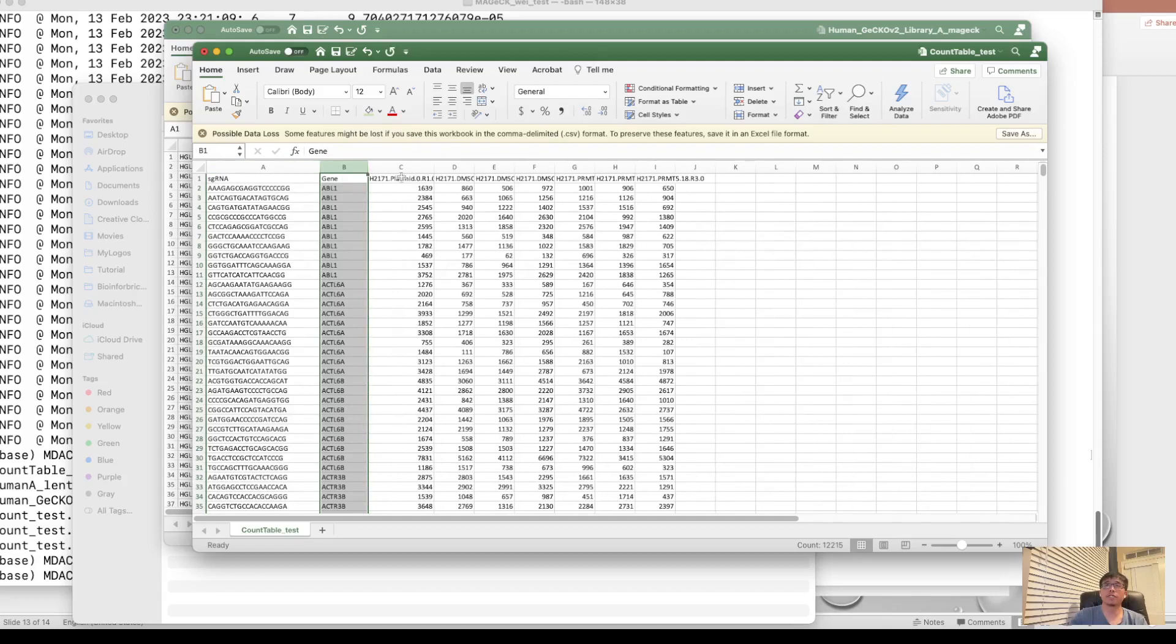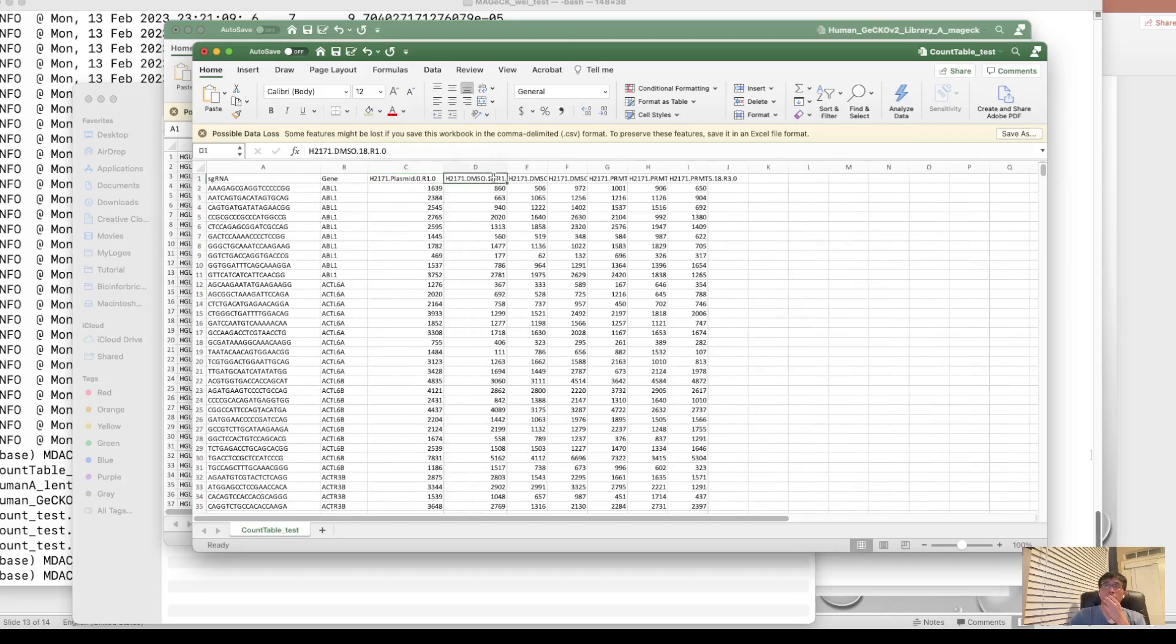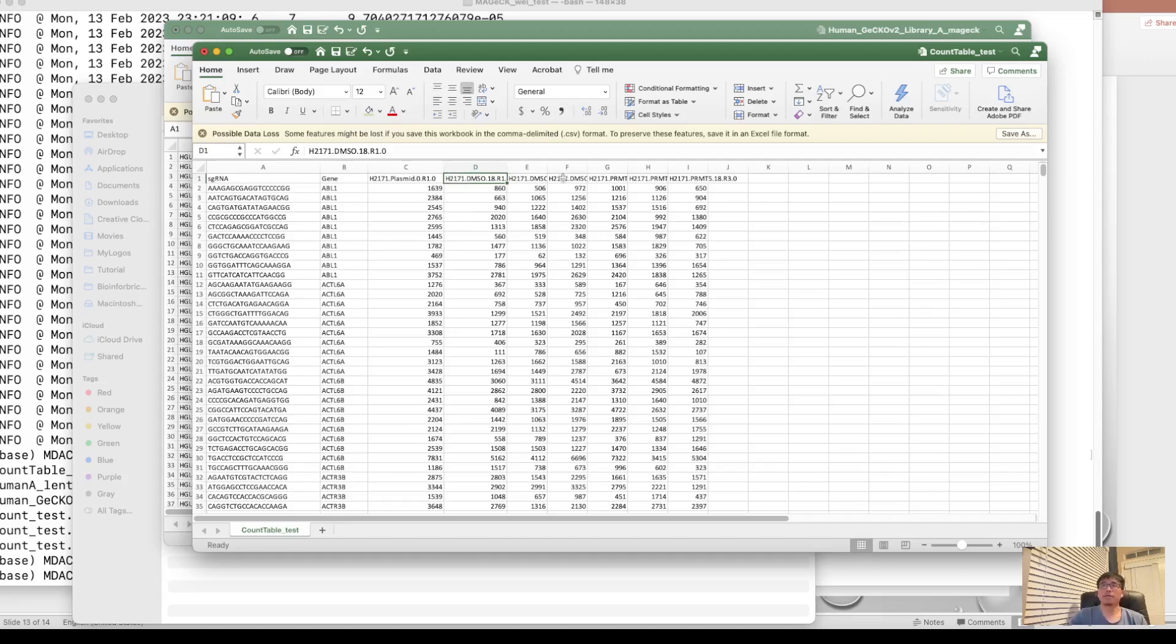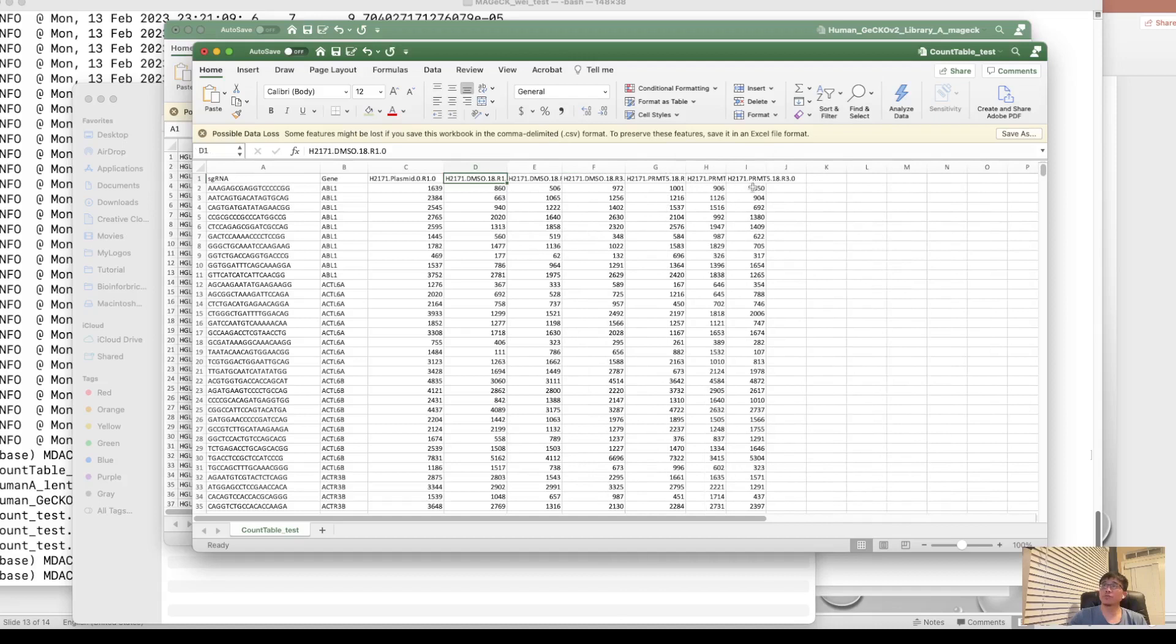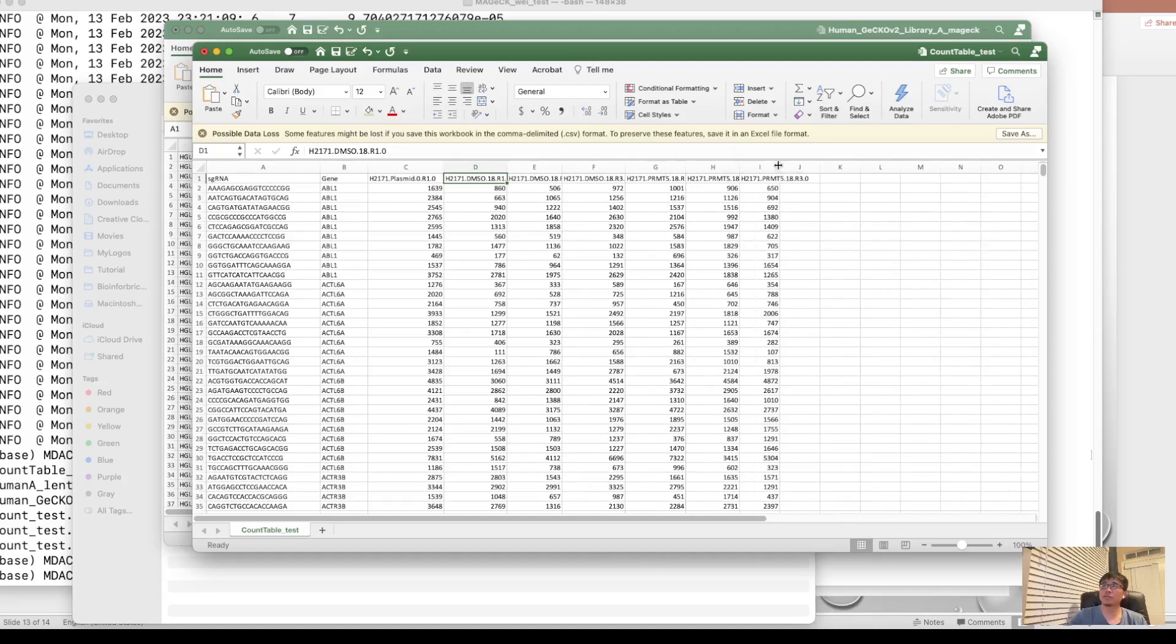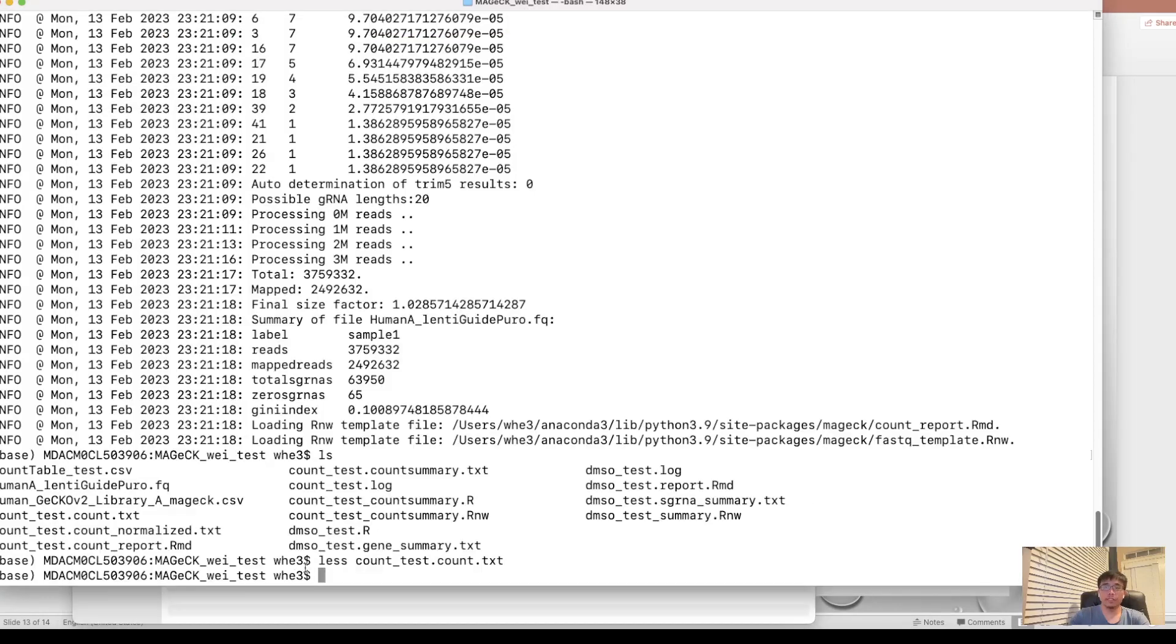The first one is the plasmid. You can use it as a control. And the following is the DMSO condition at day 18. And it's performed on H2170 cell line. And it has the three replicates in the fourth, fifth, and sixth column. And these are another three columns is another treatment using the PRMT5 inhibitors. So we have like three conditions and two conditions with three replicates.